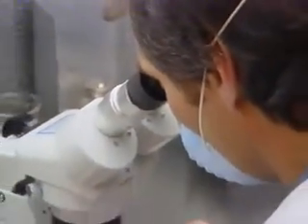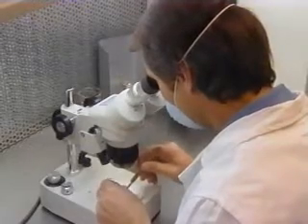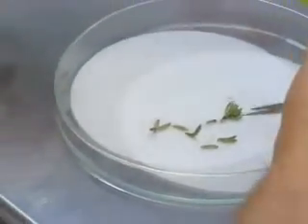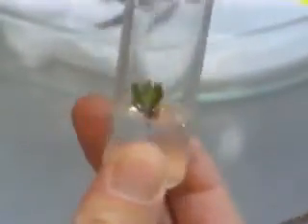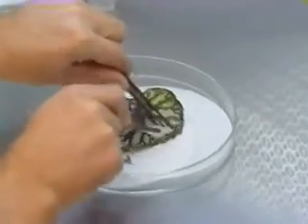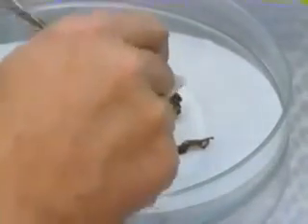Removal of only the meristem dome and a few leaf primordia requires very fine micro tools or scalpels and use of a dissecting microscope. If the entire shoot tip is used as explant, the operation is less exacting. In either case, the work must be done quickly and the pieces must be inserted on the gelled medium quickly to minimize desiccation. In other cases, leaf segments, petiole segments, or root segments may be cut following the same instructions.